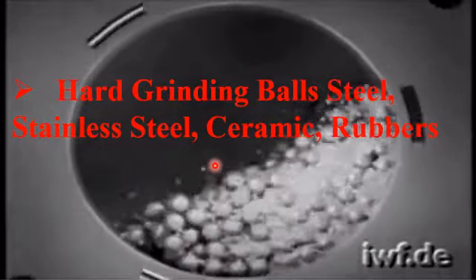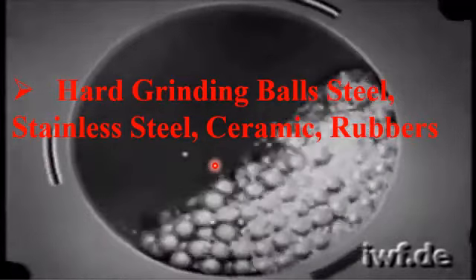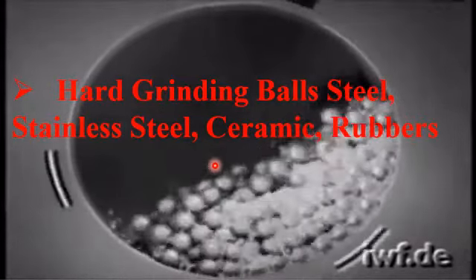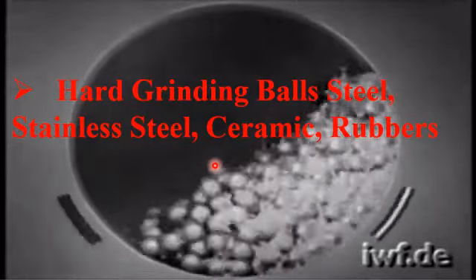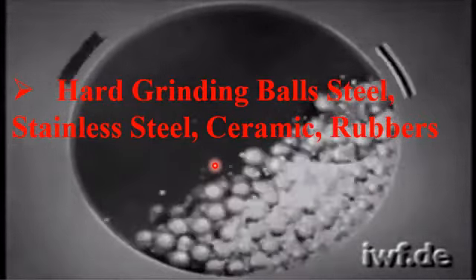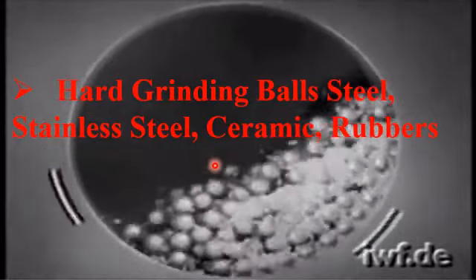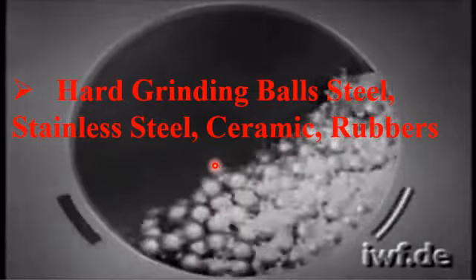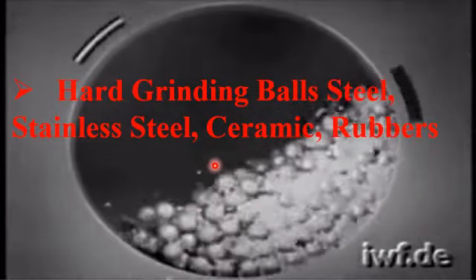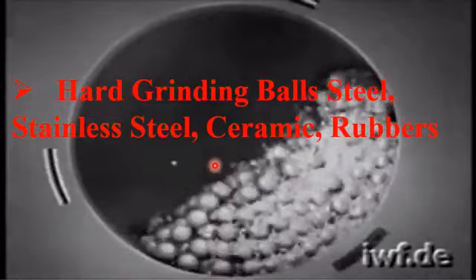Please note, students, that in the mechanical milling or ball milling instrument, different kinds of balls are used. The size of the balls varies from large to medium. These large to medium size balls are mechanically rotated on their axis.